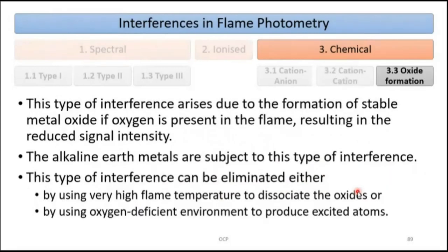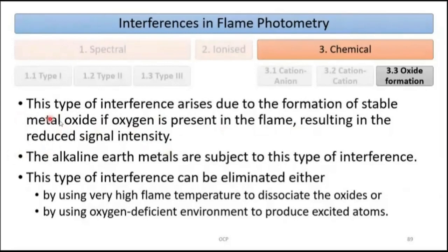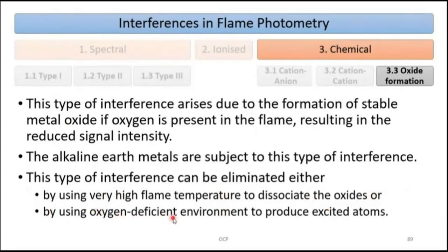The third subtype is oxide formation: at high temperature, stable metal oxides form if oxygen is present in the flame, resulting in reduced signal intensity since the metal oxide does not break down to release free metal for absorbance. Alkaline earth metals are most prone to this. It can be eliminated either by using very high flame temperature to dissociate the oxides, or by using an oxygen-deficient environment to produce excited atoms.